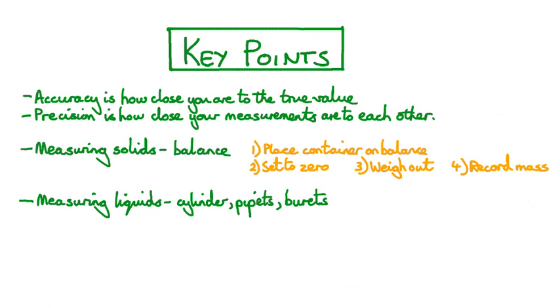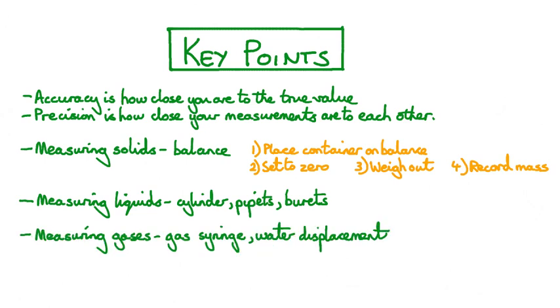When measuring liquids, we tend to use graduated cylinders, pipettes and burettes. To measure out a gas, we use gas syringes or water displacement equipment. And always remember to measure from the bottom of your meniscus.